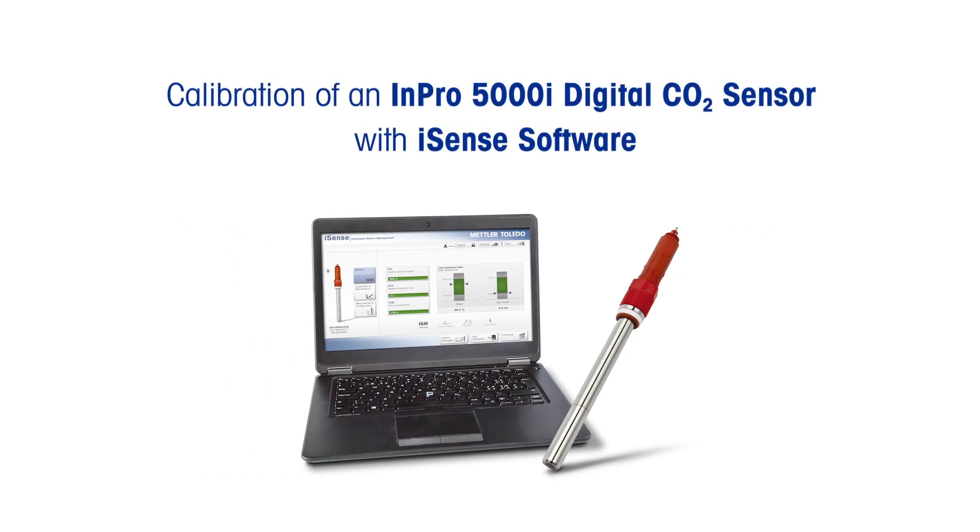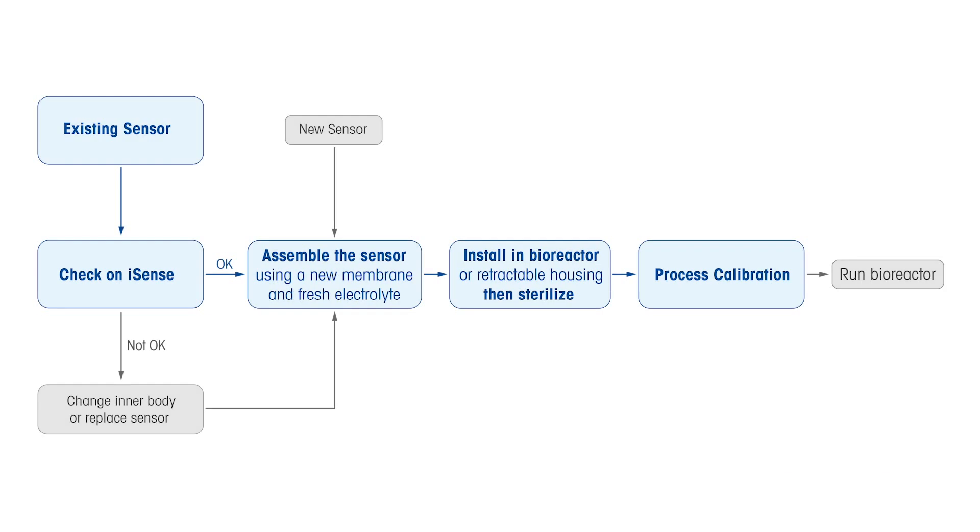The NPRO 5000i is a digital dissolved CO2 sensor for biopharmaceutical processes. All the necessary steps for maintaining the sensor and getting the best performance from it are explained in this video. It comes factory calibrated and the digitization of the sensor removes the necessity of frequent calibration. It only needs a post-sterilization adjustment in the bioreactor with a calibration gas before use.